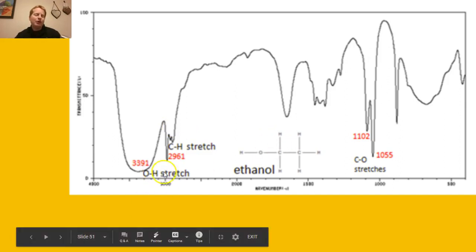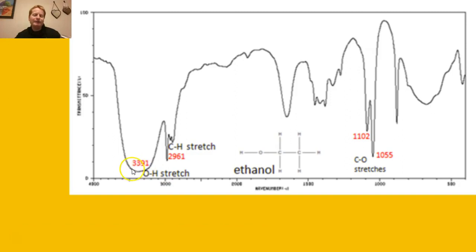And then we also have an O-H stretch represented more on the left here, which there's an O-H here as well. So scientists combine all this information in order to determine, hey, this is the chemical structure. And they're also going to compare it to their known infrared spectrums of ethanol and say, yeah, this matches ethanol, we've got ethanol in our hands type thing.